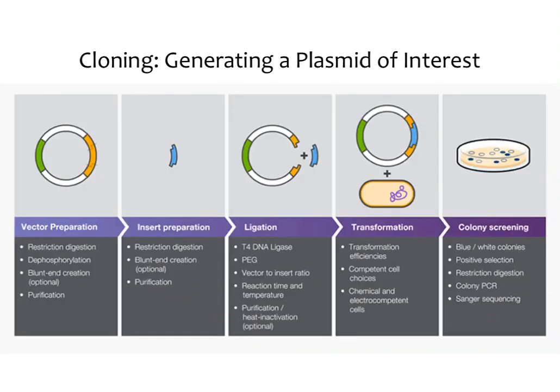All right, so when you want to create a plasmid, there's a few options for getting a plasmid. One is to clone it by yourself in the lab. This gives you an overview of how you might clone, but the basic idea is that you have some sort of backbone plasmid. This is your backbone that has most of the pieces you need. For example, this might already have your ampicillin, it might already have the puromycin, and all you need to add is your gene of interest. This is your gene that you want to add. This could, again, be RFP, it could be GFP, it could be an sgRNA. The point is it has that piece that you're interested in adding on.